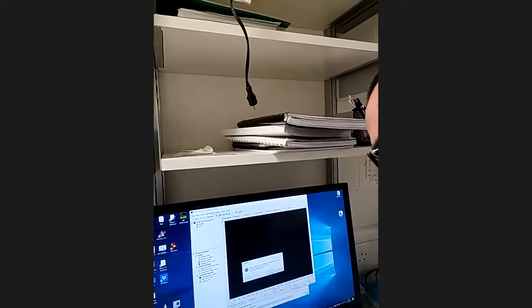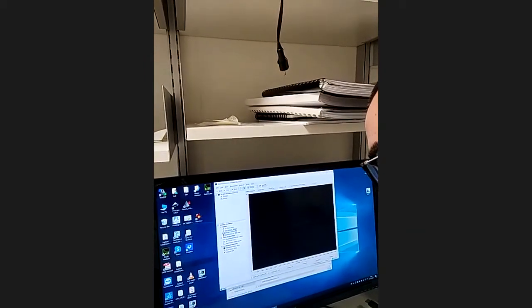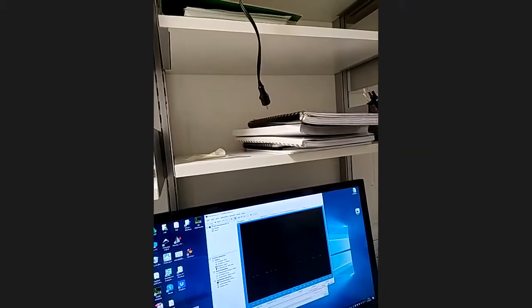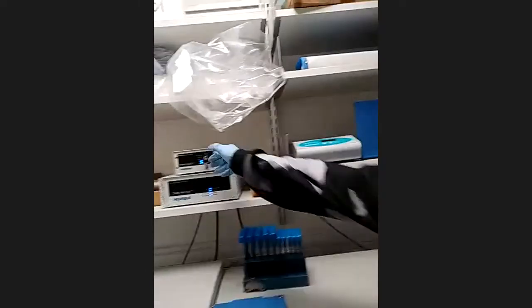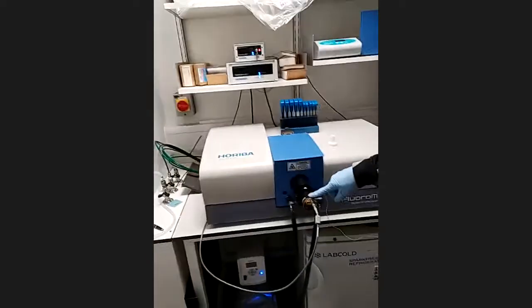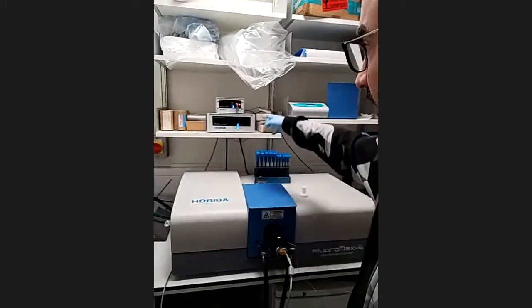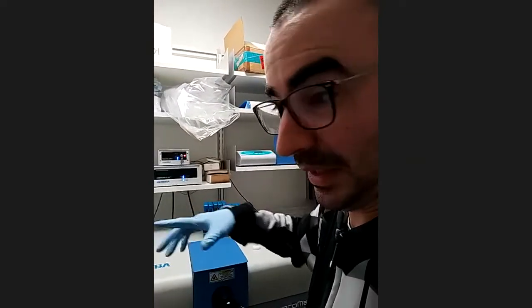Right. So I'm going to measure the fluorescence lifetime now. Set the bias on that. Oh, it's not working. What have I done wrong? Oh, I didn't turn it on. So now instead of using the light source that was built into the thing, I'm going to use an ultrafast pulsed LED, which is going to chuck packets of ultraviolet photons in at the sample. And then this more sophisticated optics is going to measure very quickly the time that it takes for photons to be emitted. So we can measure the fluorescence lifetime of the thing. Start again.